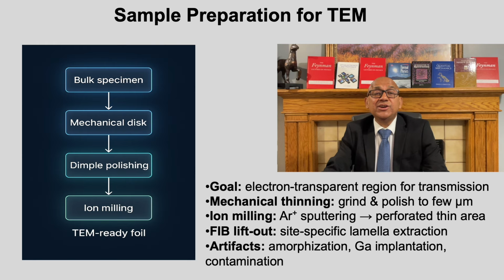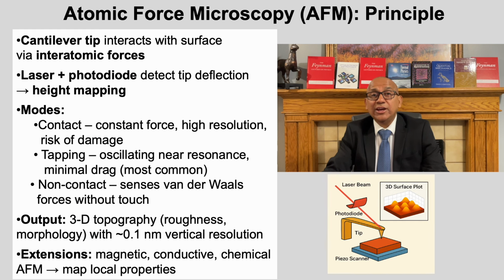Ultimately, sample preparation is as critical as imaging itself. A poor sample can easily mimic non-existent defects. Always interpret TEM images with awareness of possible artifacts, and where possible, corroborate findings with complementary SEM cross-sections or AFM topography.